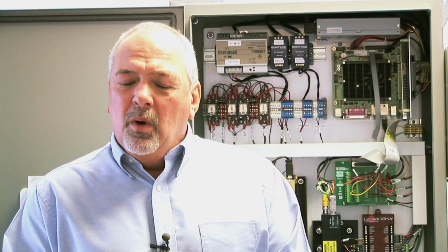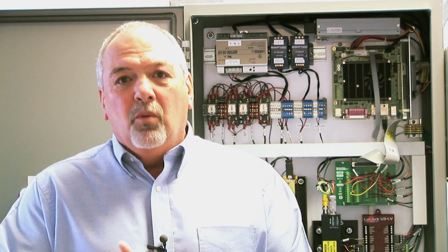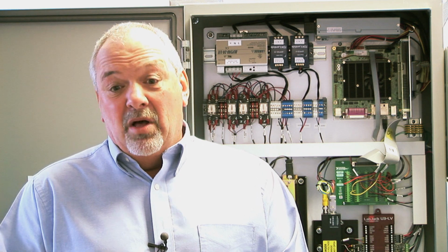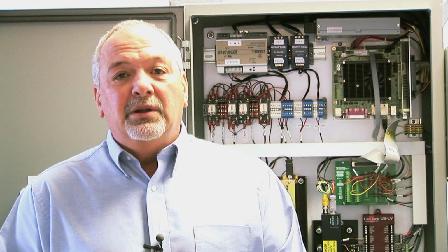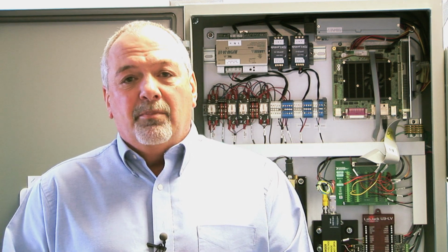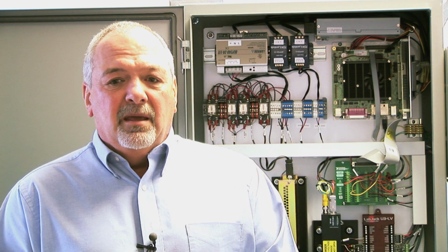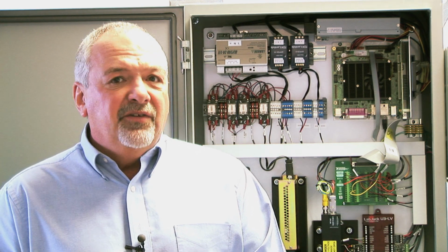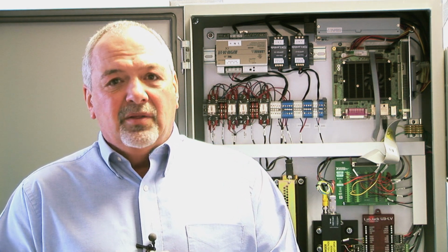And they asked me, well, what were the 3 most important or valuable parameters that we could develop for this machine? First of all, what came to mind was COD. We run COD parameters throughout the plant on a number of different process points to see what's going on very quickly, because we can turn that around in just a few hours. The problem with that test is it's very expensive in the materials and supplies to run. So that was an obvious first choice to reduce expense.